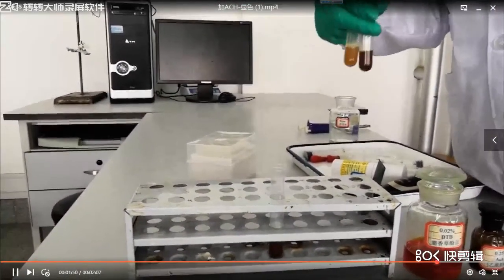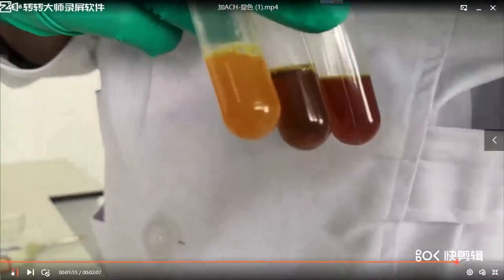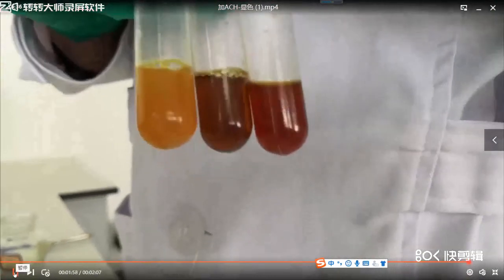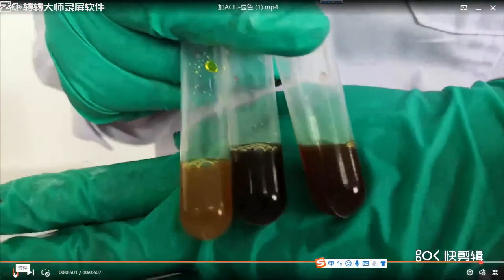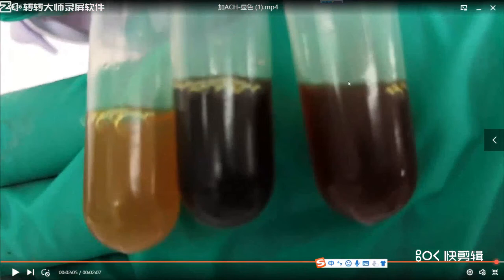The first one, yellow, means the high activity of cholinesterase. The second tube, dark, maybe it looks green or dark yellow, means the lower activity. And between them is the third tube, where we used PAM chloride. The cholinesterase activity is increased, so higher than with organophosphate, but still lower than normal.